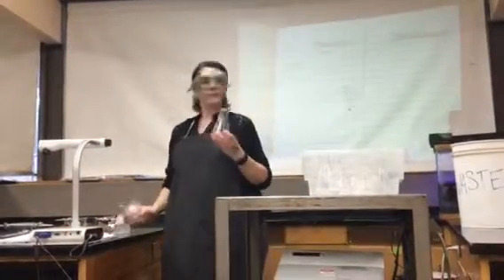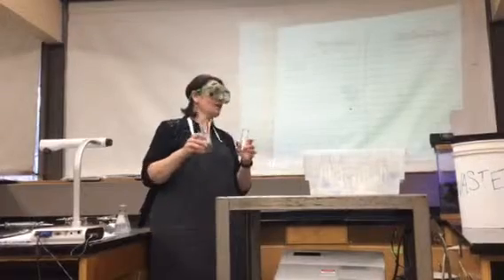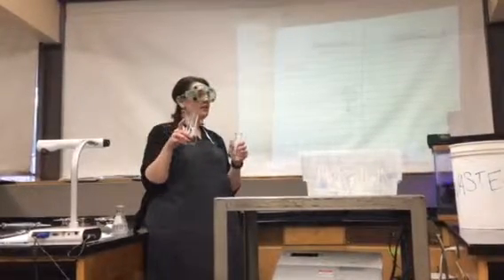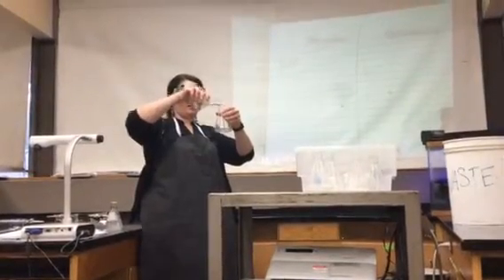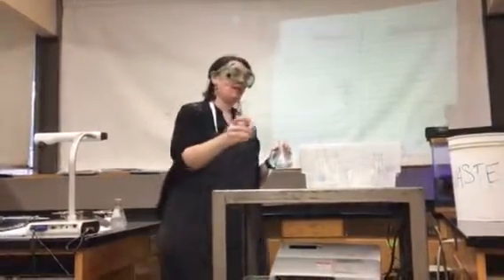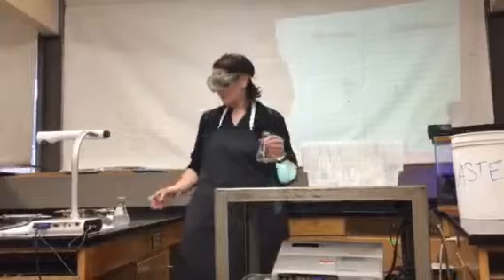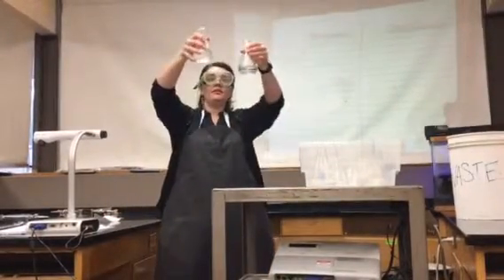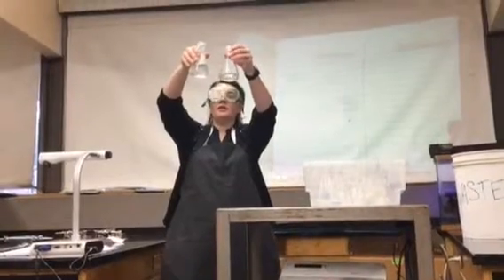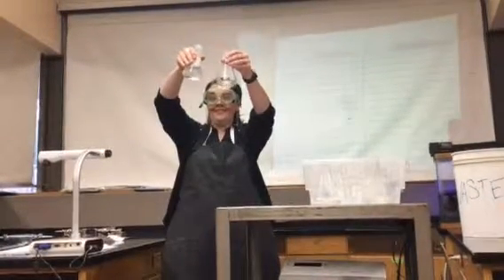Alright. I have to take it over to the chemistry hood and let it evaporate. It takes a really long time, but yeah, it evaporates. I'm not gonna drink that. Okay, D and E. You ready? Are you ready?